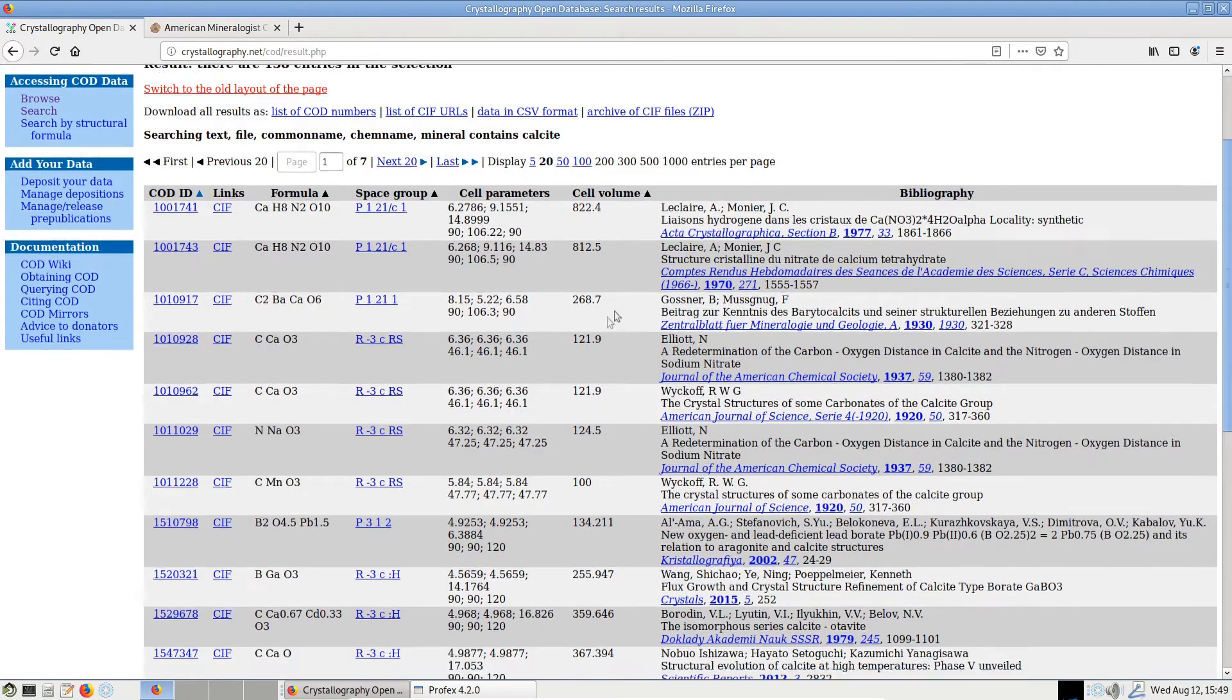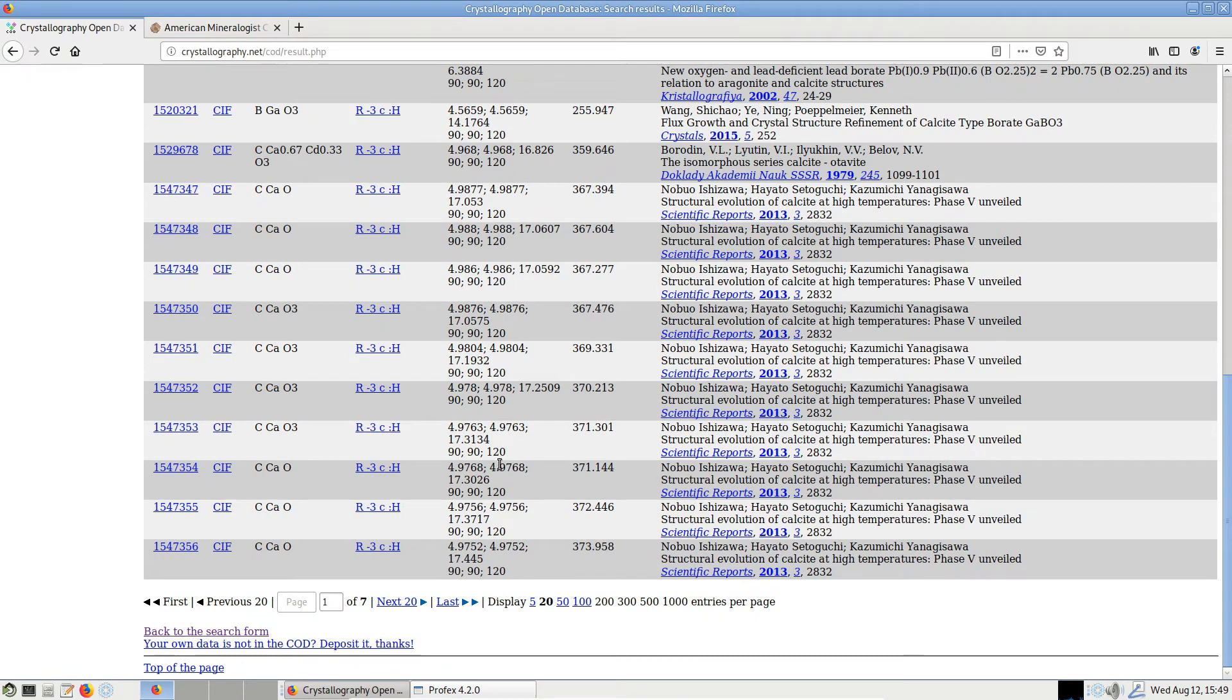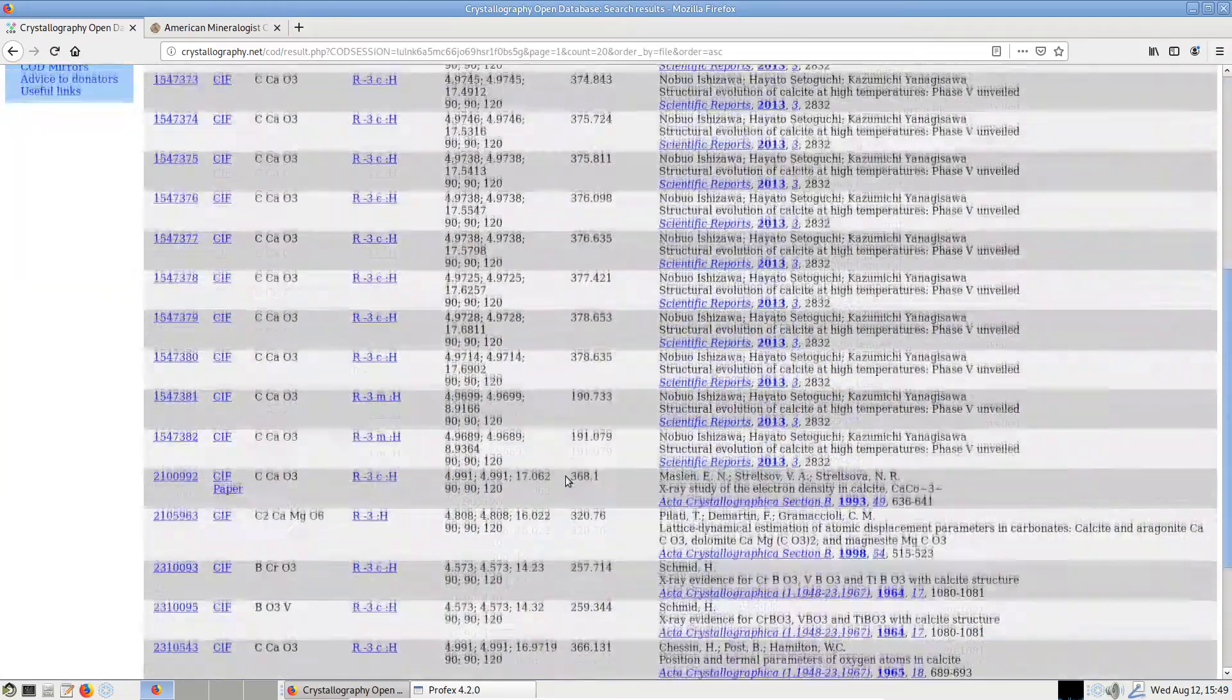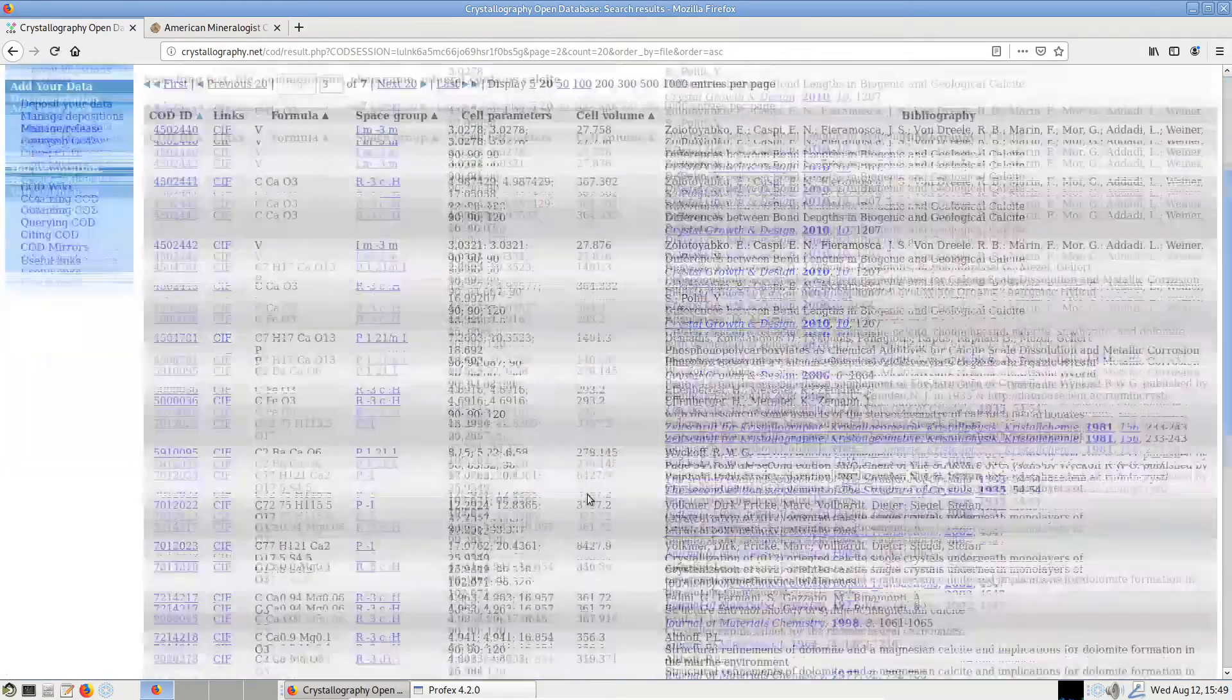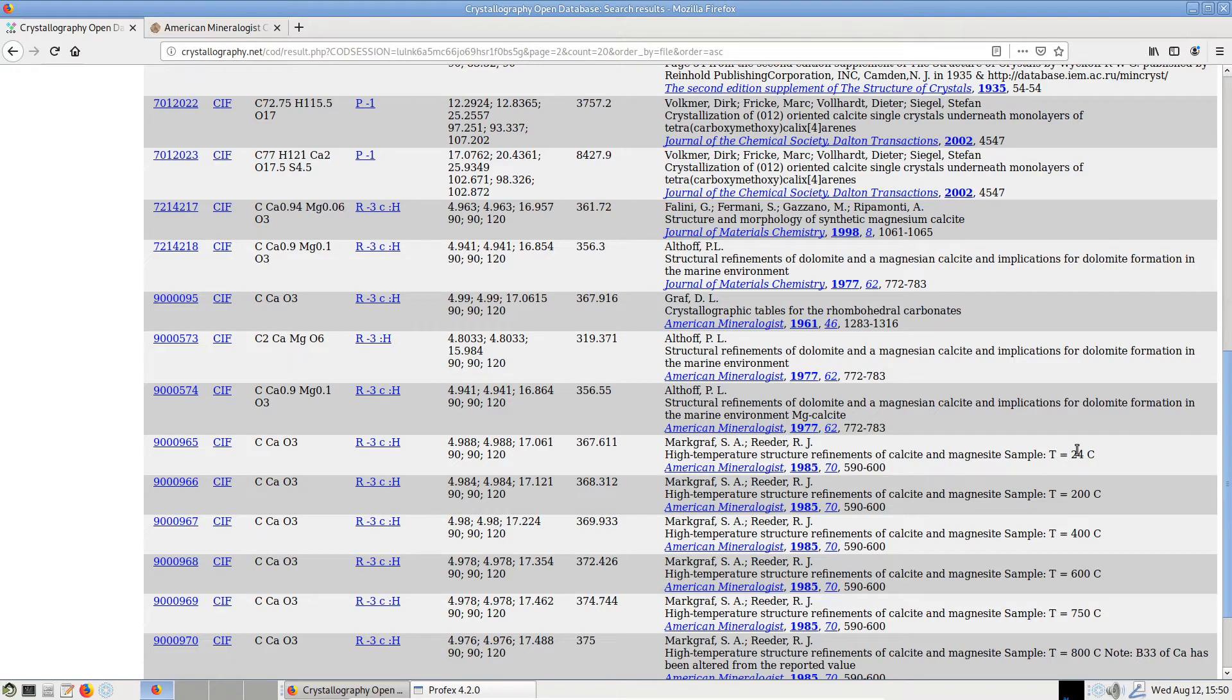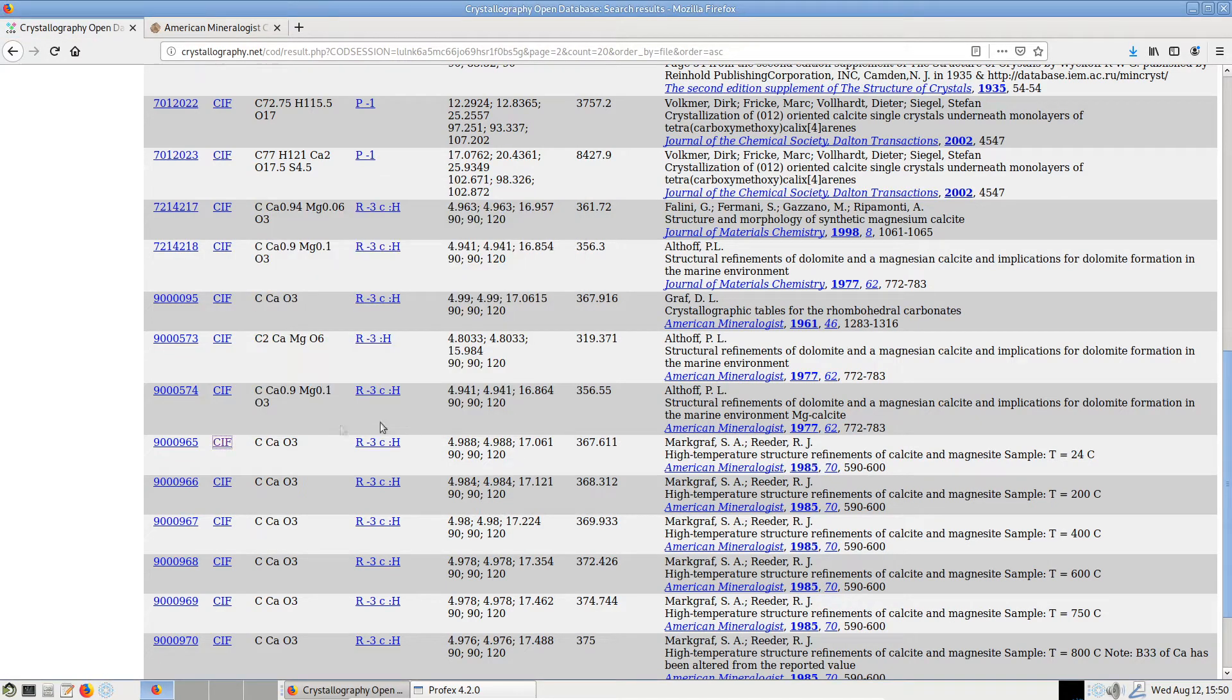So we can just pick one, preferably measured at room temperature, no high temperature phases. Let's maybe take this one here - it says in the title that it was measured at room temperature. So we can download the CIF file, and this is a format supported by Profex for structure file import.